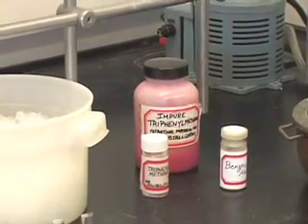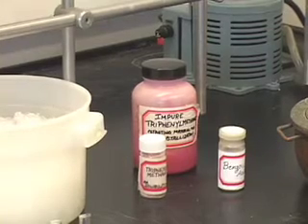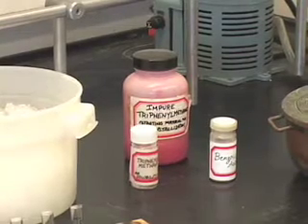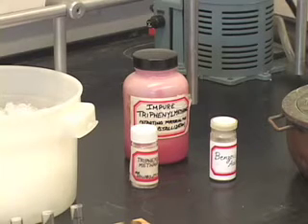To purify an impure solid by recrystallization, what we need to do is first figure out the solvent of choice for recrystallizing. What are the criteria that you have to bear in mind while selecting a solvent for recrystallization purposes?